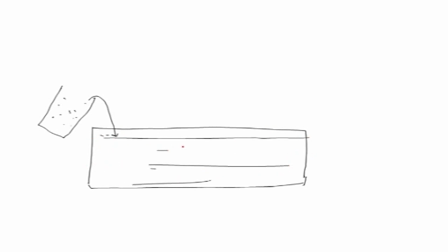On this you will have a slurry which is prepared, and this will be poured on the glass plate and spread evenly. The slurry will have a certain thickness and will act as the stationary phase, like silica gel or alumina gel or others.